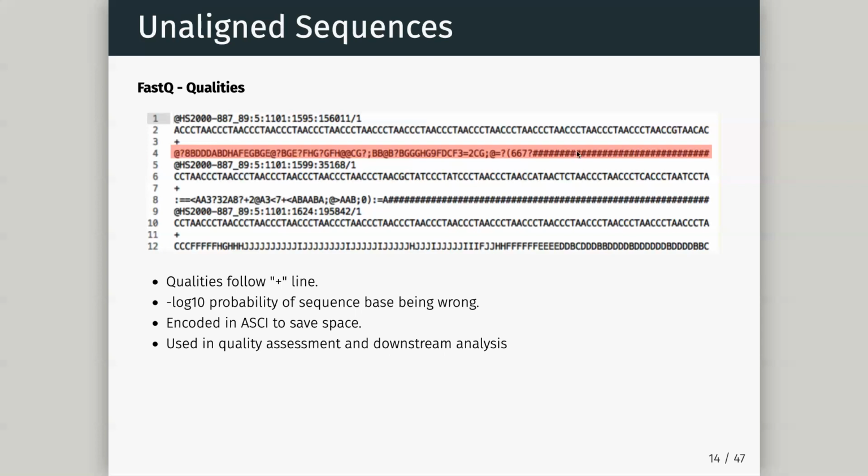We can also use this quality, and you can often notice, here's kind of an example. Clearly, hash is the lower quality because we have lots of things ending with hash. Often in Illumina sequencing, the reason you start to drop off in quality is just reagents start to run out. The machine has a certain amount of reagents to try and push this. So you'll often see quality drop off over time. And again, we can use the quality scores to say, oh, when did it start to get bad? And we can start to do clipping based on these quality scores. I'll throw away the last 10 bases. We're going to see that when we start doing a bit of programming.